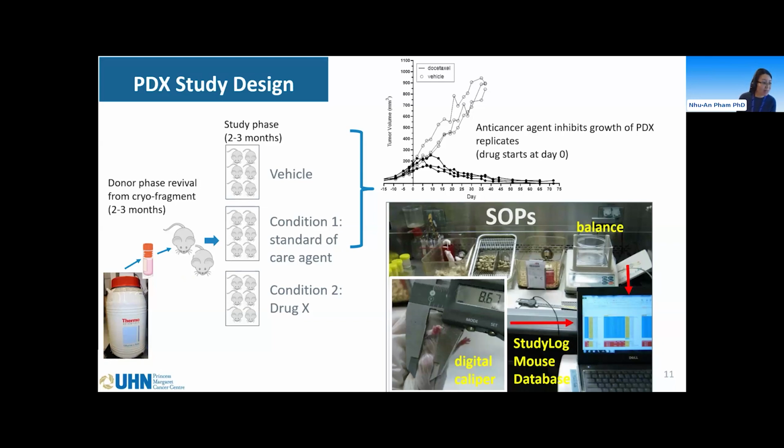This is based on practice and how far we can push the system, and it really depends on a few things. Nikki and I try to push what the clinic can extract and then have it delivered by the coordinators to our lab. The quickest is from biopsies, and we get it within 2 hours. Usually between 2 and 4 hours is a typical time that we get fresh tissue in the lab, and we try to use it on the same day. For most of the tumors, it's worked well. For the more aggressive tumors like pancreas, I think Nikki's been able to get away with longer, like overnight in the fridge for sample handling, right, Nikki? So it depends on the biology of the tumor. But from experience, using the fresh tissue from the clinic within the same day is the best. And the sooner, the better.